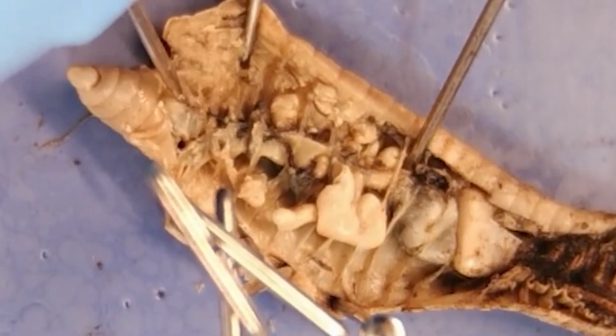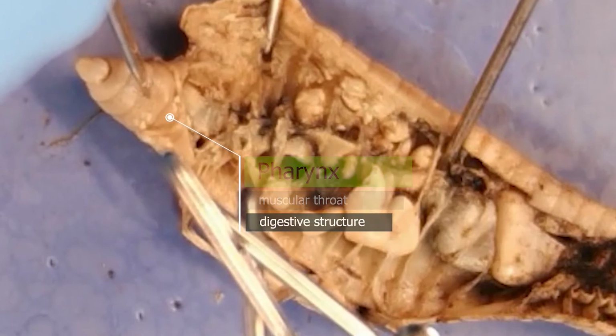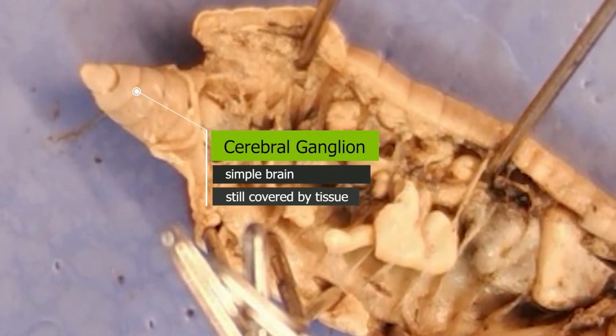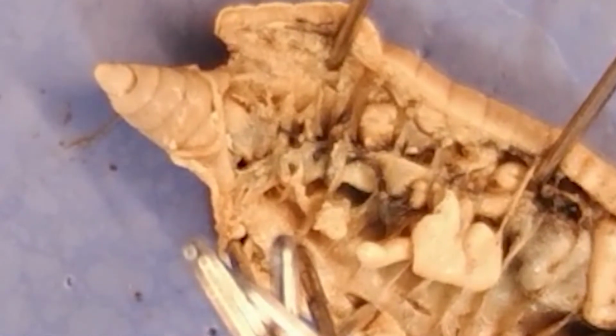Now up here is the pharynx, or the muscular throat, and typically the brain is difficult to find, but they have what's called a cerebral ganglion, or a brain. Okay. Now how small or how large would that be? It'd be very small. It would be hard to even see, and usually when you look at it, it kind of looks like a spiral.